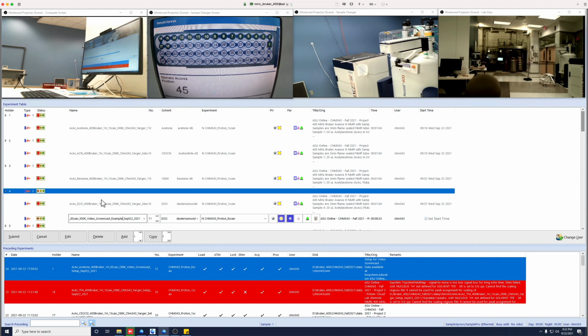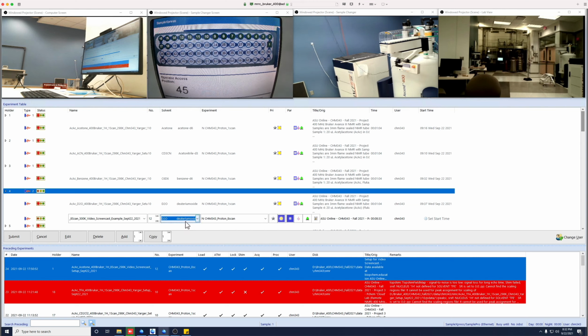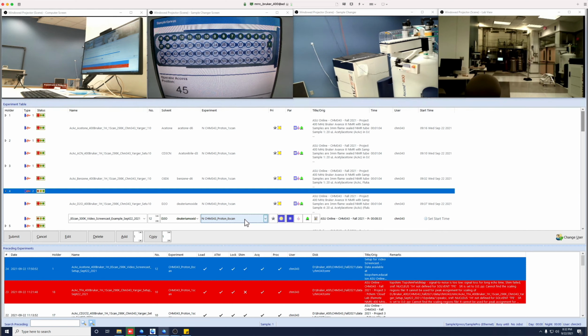So what you can do is you can queue up as many experiments on each one of the samples as you want, and on each of the individual samples. This is in D2O, so we will leave that. If you don't give it the right solvent, it won't work properly. You can select between any of these experiments to do different types of experiment, kinetic experiments, different number of scans depending on what it is. You can look at the structure of it by doing different types of correlation spectroscopies, etc.